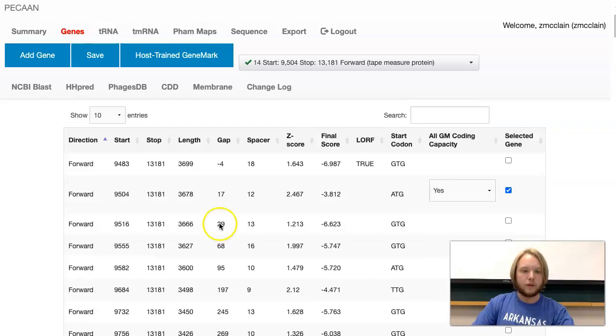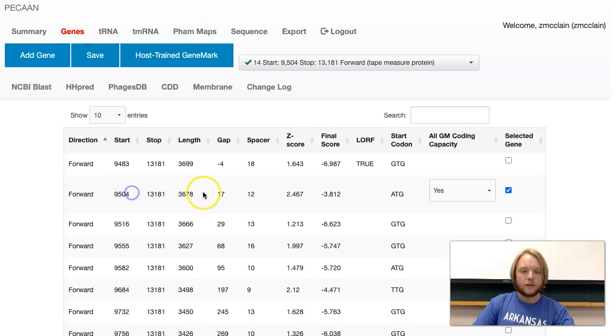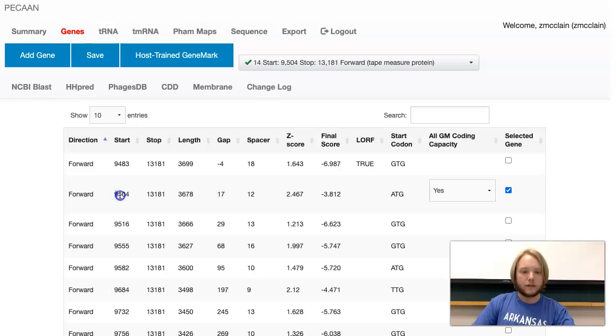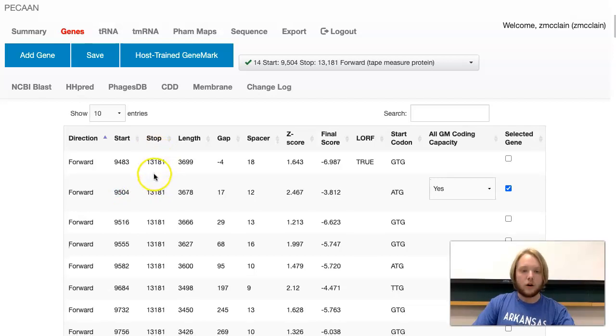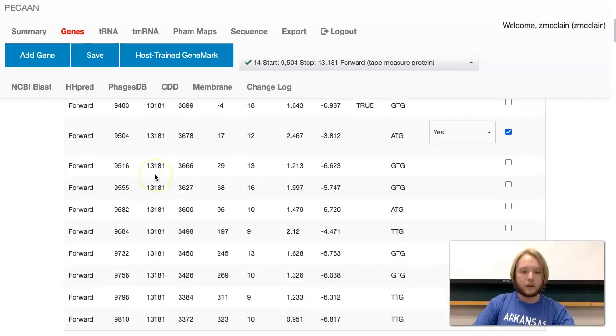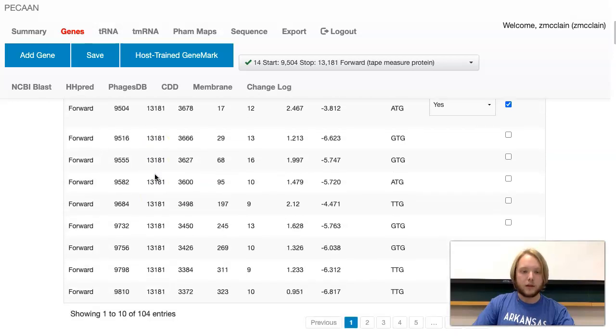The number it lists is the base pair position. For example, this start is at base pair 9,504. This gap number is talking about how many base pairs are between it and the gene before it. The stop codon, if you look down this column, all of the stop codons are the same.